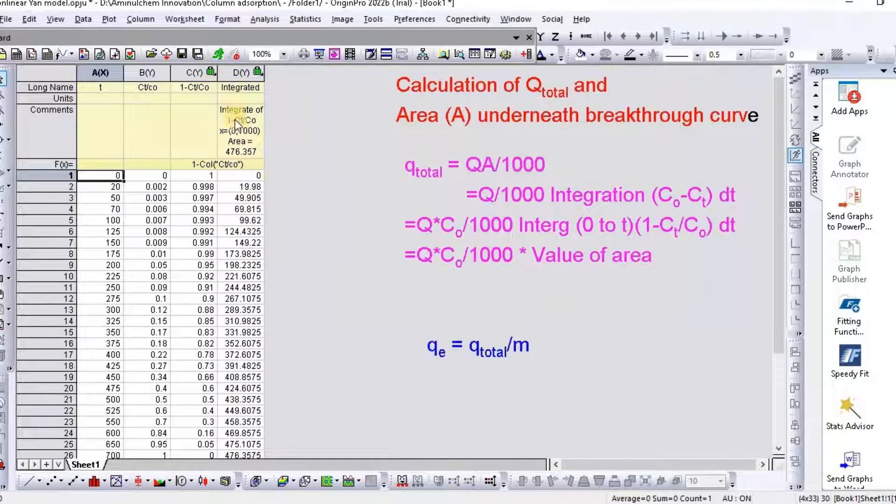So see, here is the integrated value from 0 to 1000 and area is 476.357. This is the area.